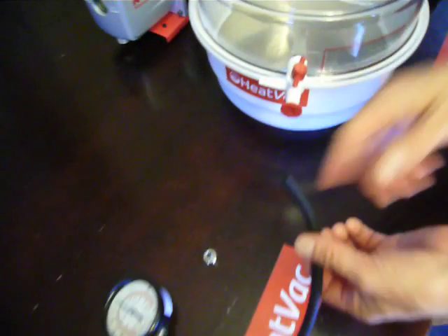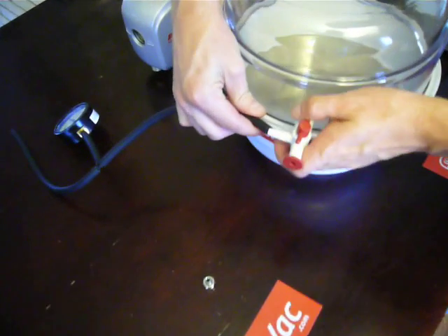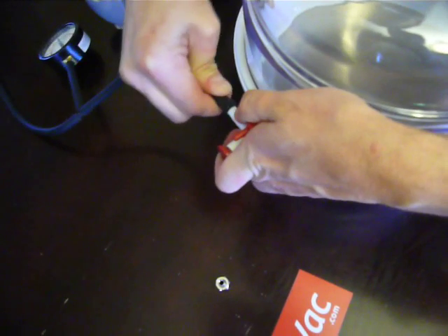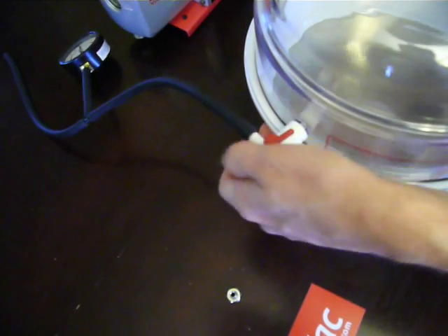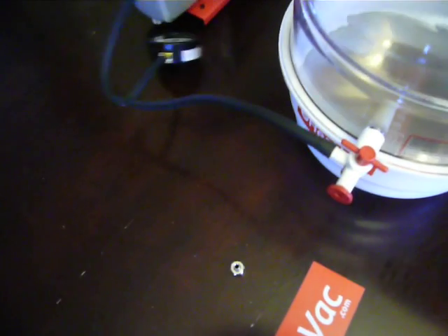Next, we want to take our hose and gauge kit and hook one end up to the barb fitting on the chamber lid. That connection is not very sensitive — you can go ahead and push it on wherever it's comfortable; it's not going to leak there.